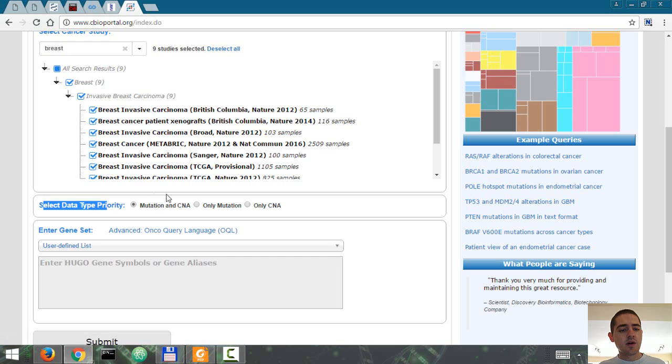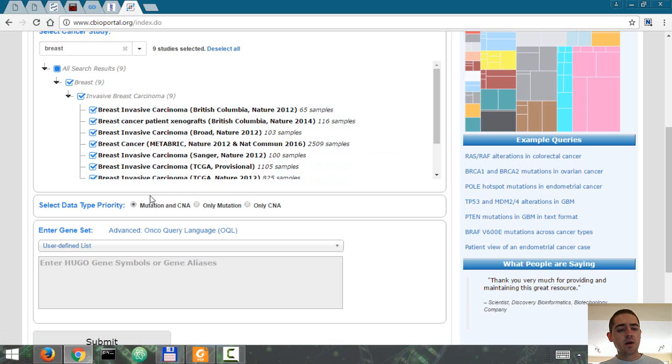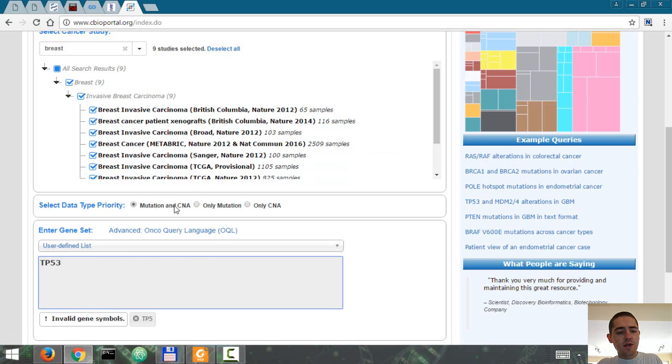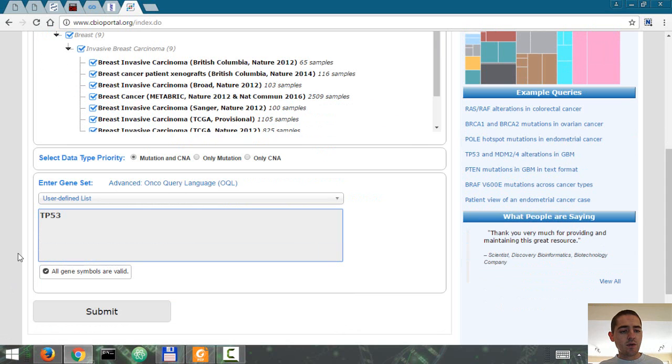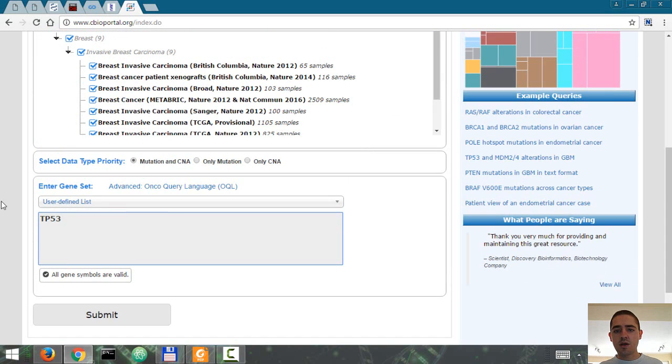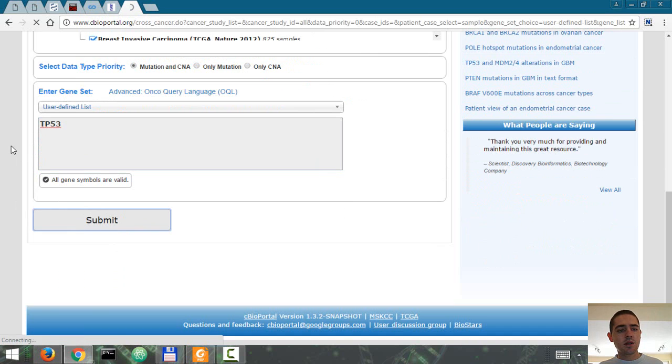Here I'm going to select mutation and copy number alterations for the type of data that we want to have. And I'm going to search for the TP53 gene, which codes for P53, a tumor suppressor protein. I'm going to hit submit.